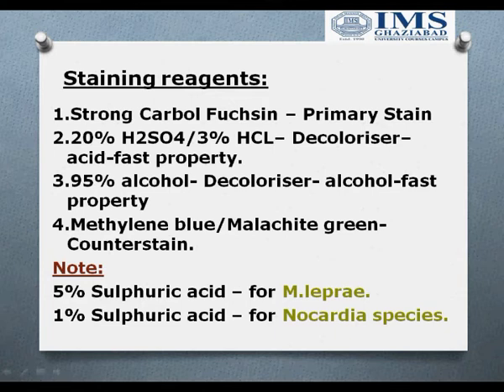One special note is there. If we are going to study Mycobacterium leprae, which is the cause of leprosy, in the second step we will use 5% sulfuric acid, and if we are going to study Nocardia species, then we will use 1% sulfuric acid in the second step.